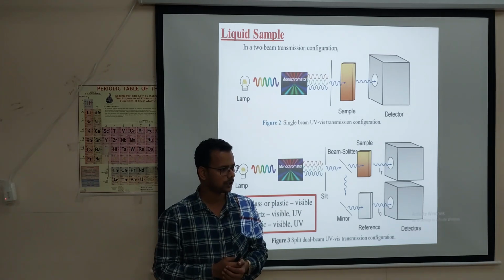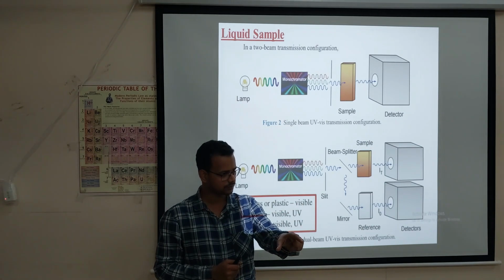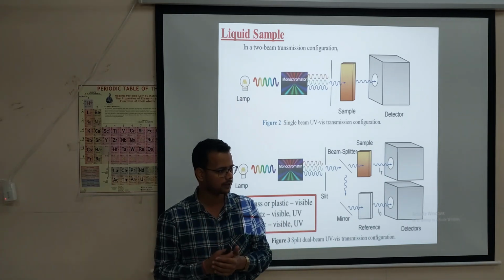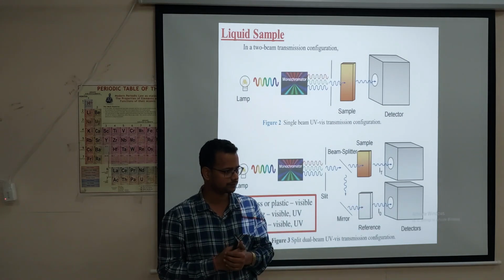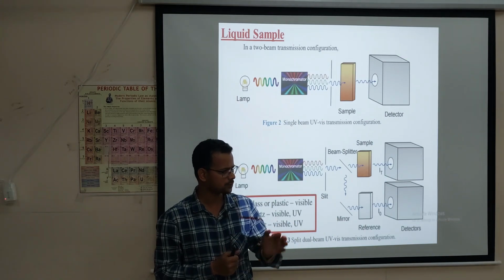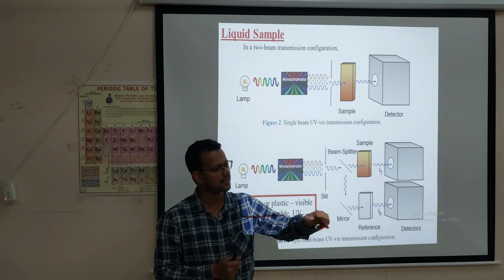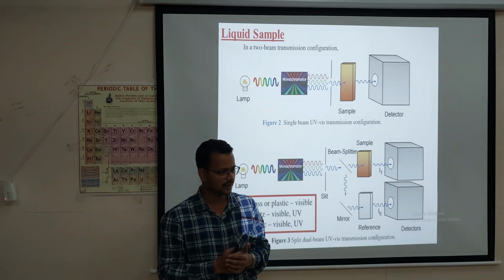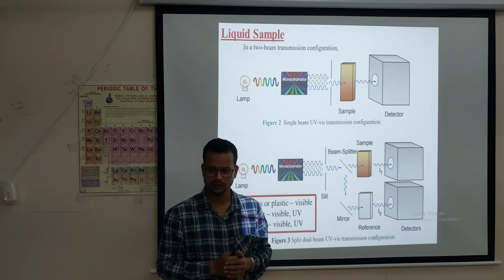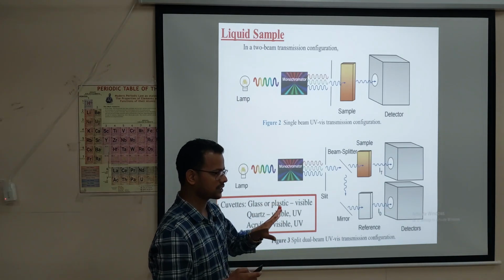We are able to change the wavelength of light by changing the slit, so that a particular wavelength of light strikes the sample. Suppose we need 200 to 500 nanometers. We put that range, and the slit will automatically change, and that portion of light, that energy of light, will pass through. We can also change it manually, and it is possible to slide it. Am I clear? So I think the monochromator and slit are now clear.